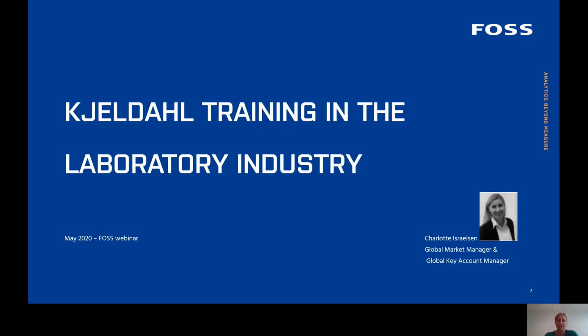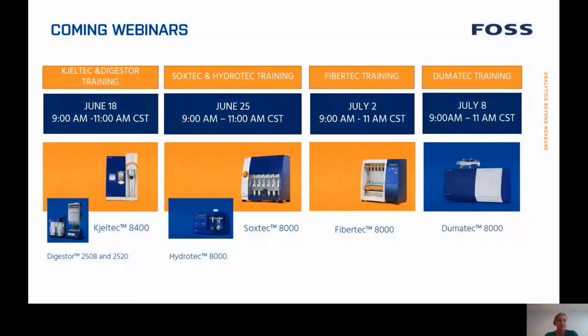As a laboratory, it is critical to maintain analytic instruments in order to ensure accuracy and decrease downtime. Our main focus on our webinars will therefore be describing theory, basic maintenance, and troubleshooting on our automated chemical analysis instruments. Please find more information about our coming webinars on this page. Today's topic will be about the Kjeltec and the Digestor.